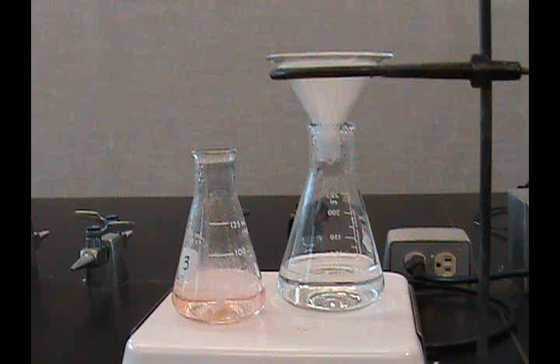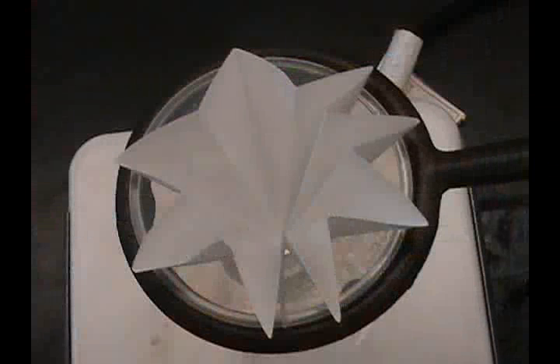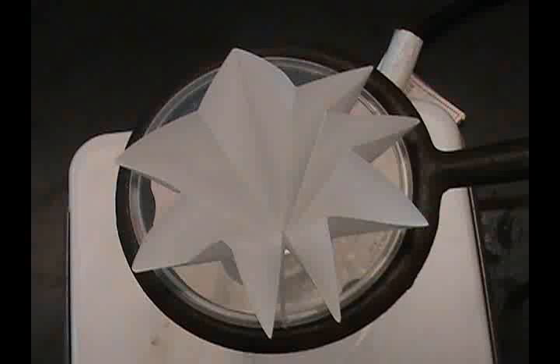In hot filtrations, a hot plate, a short stem or stemless filter is used to ensure minimal cooling, as well as fluted filter paper to increase the surface area between the filter and filtrate. This maximizes the rate in which the liquid flows through the filter paper.